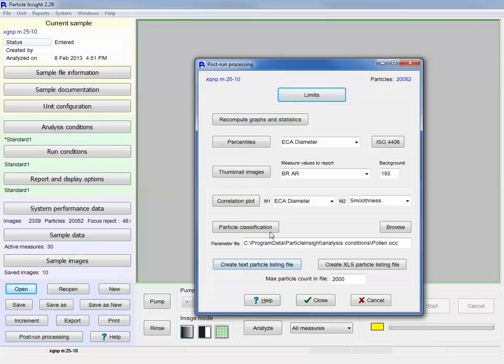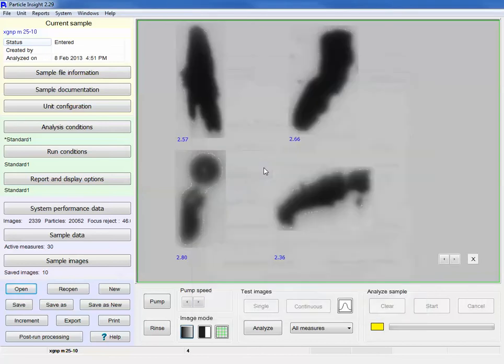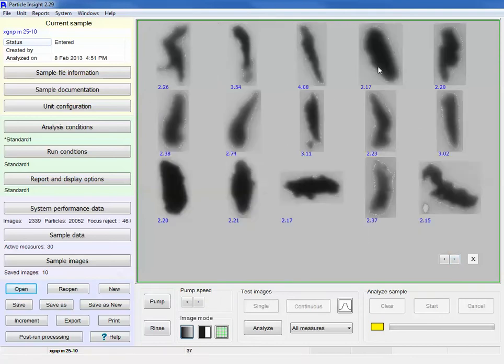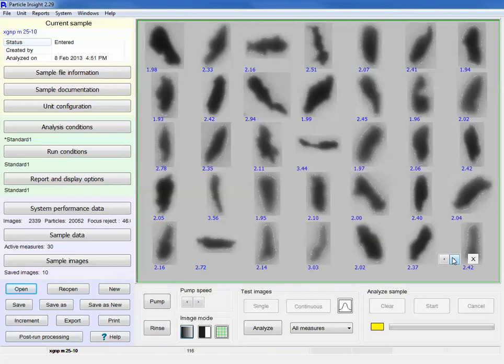And if we feel comfortable with this, let's just verify that that's a good limit to draw between the side views and the front views. That's pretty good. Maybe some of these aren't. Maybe some of these happen to be particles that are not completely on their side, but maybe on their way to being rotated to their side. We can actually increase that aspect ratio to exclude some of these particles that are on their way to rotating to their side views.